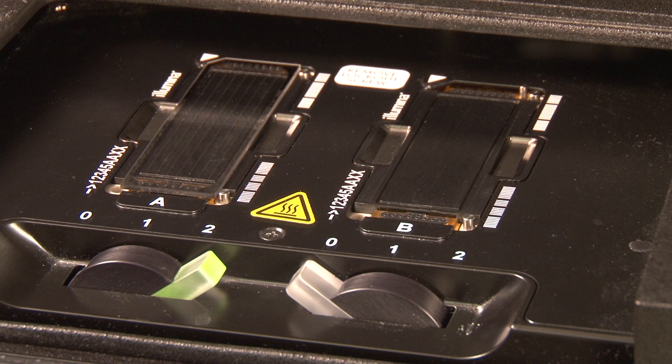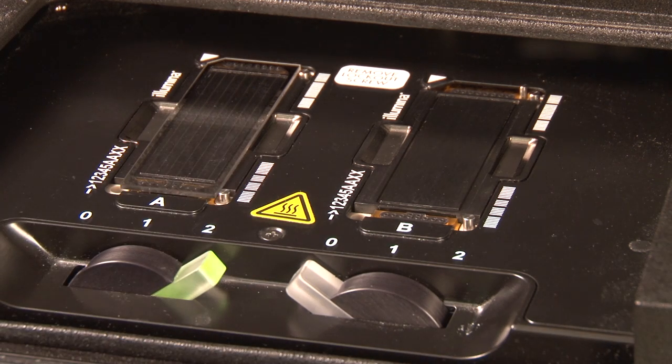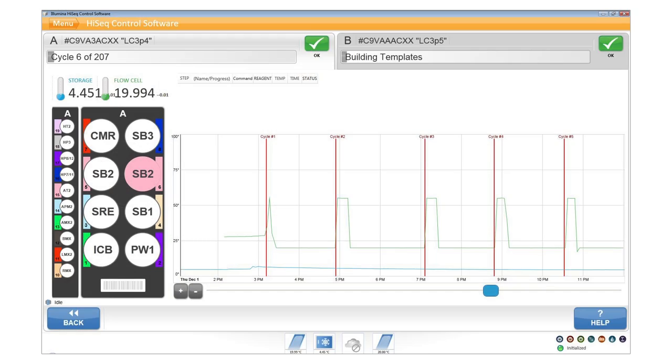The other thermal systems are the Peltiers, which are located underneath the flow cell stages. As the Peltiers cycle through a range of temperatures, the temperature profile is visible during the run on the temperature chart and also recorded in a temperature log file.